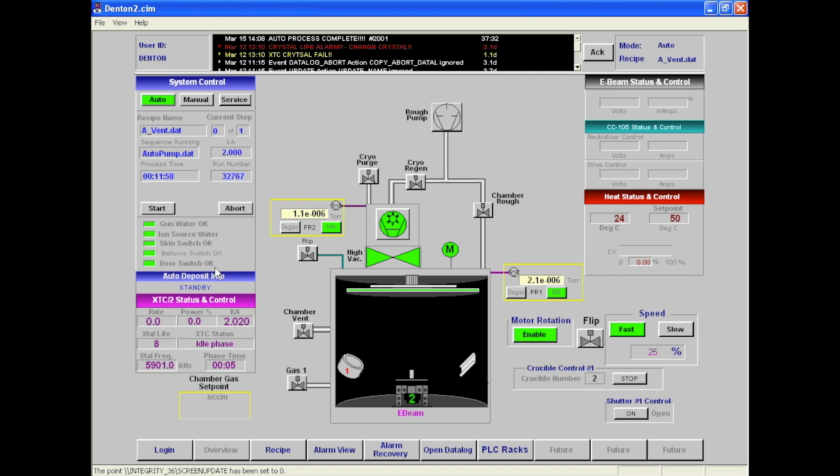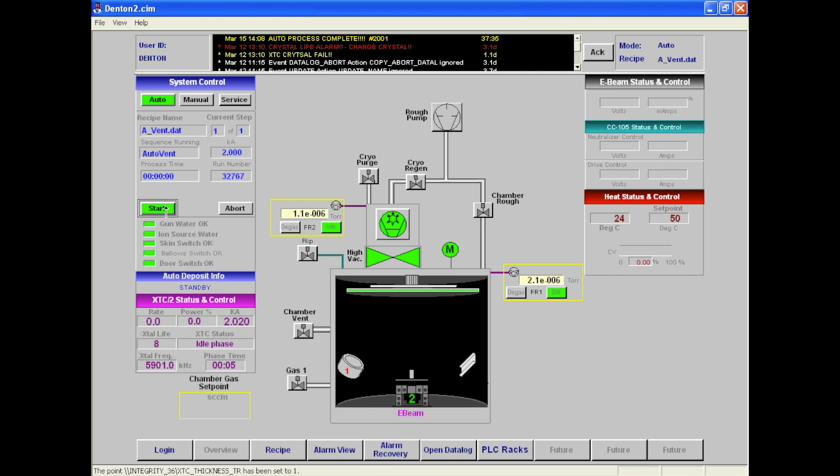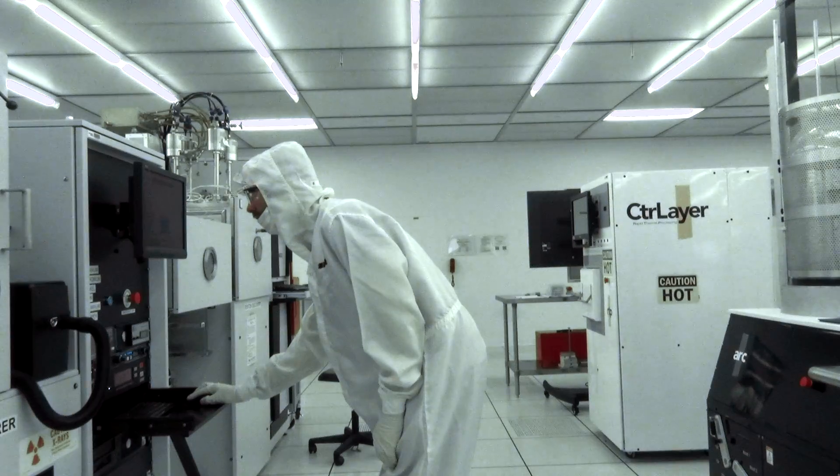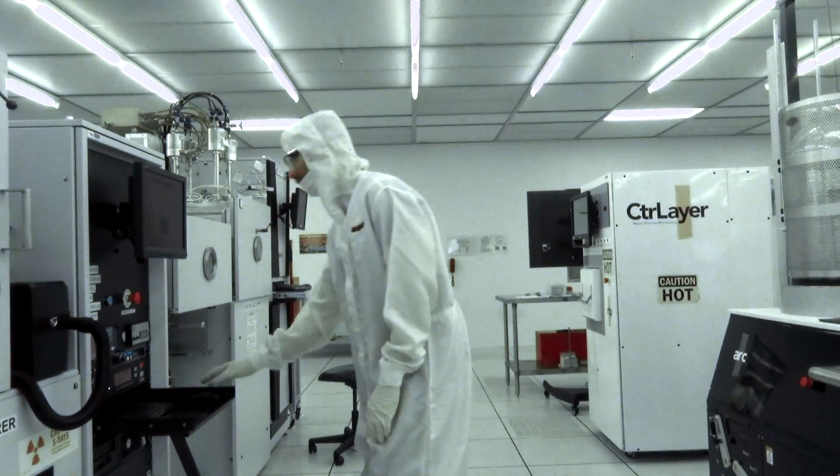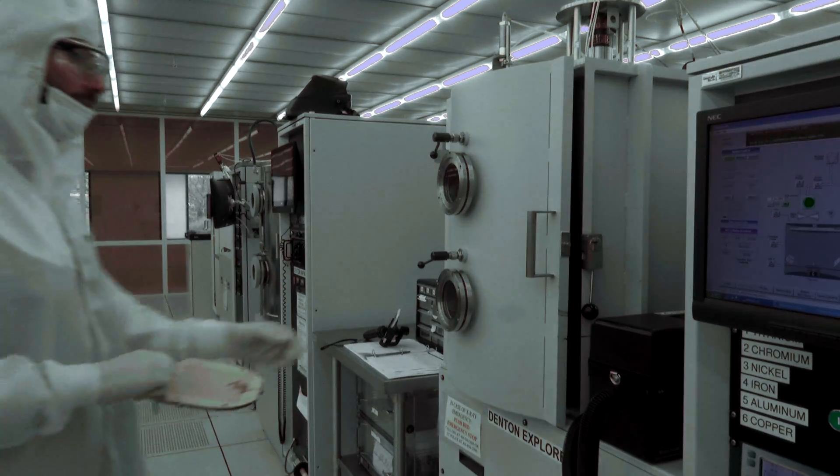Next, click overview in order to get to the initial screen. Then click start. When the chamber has finished venting, you may open the chamber.